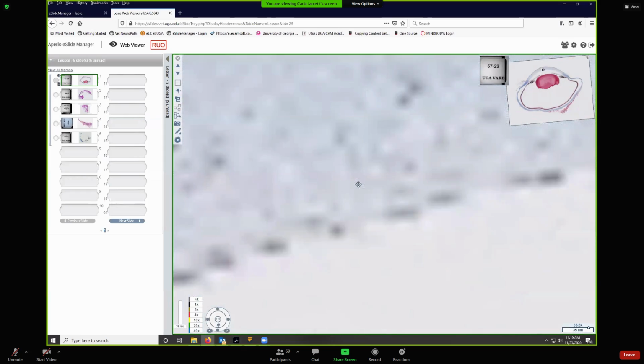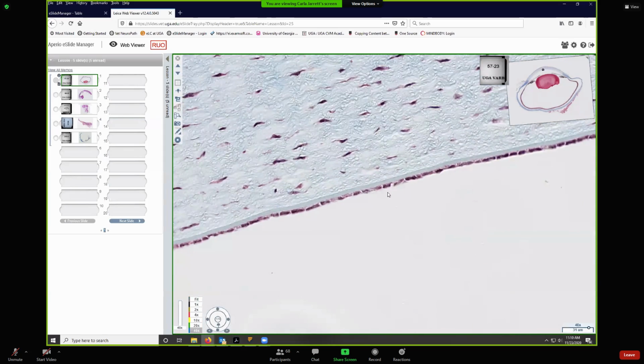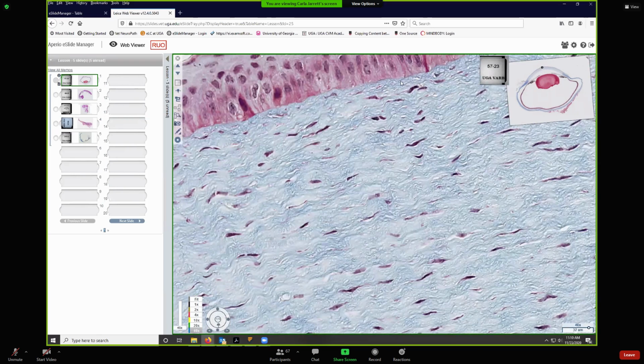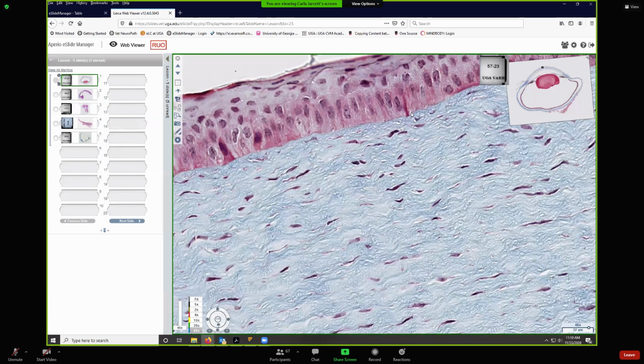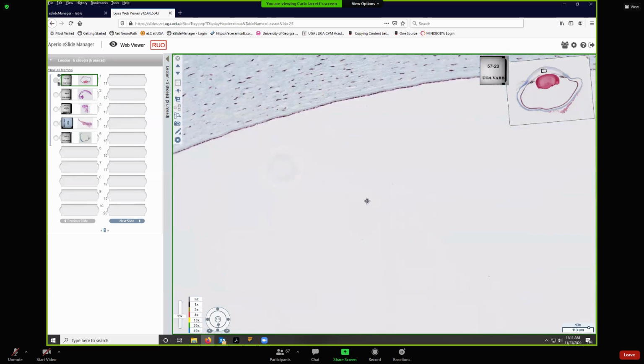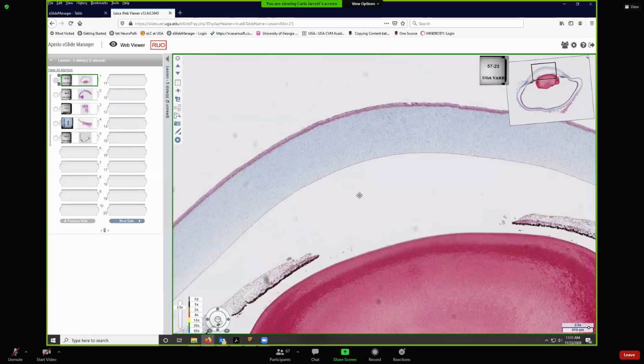And then back here, you've got an anterior epithelium and a posterior epithelium, aka the endothelium, which is kind of a misnomer, but the ophthalmologists aren't going to give it up, so we're stuck with it. Here we have this greatly thickened specialized basement membrane between the corneal stroma and that posterior epithelium. And then we have just a traditional, thinner basement membrane that you can just barely see. Really, we would have to do special stains to see it. That's also a basement membrane. So those are two components of the cornea, our basement membranes.